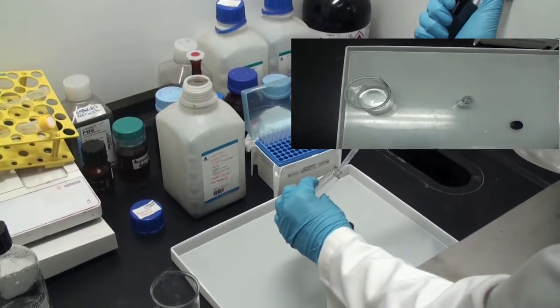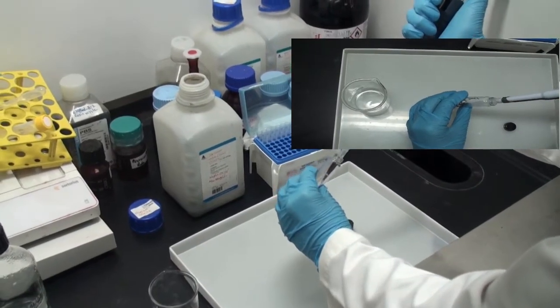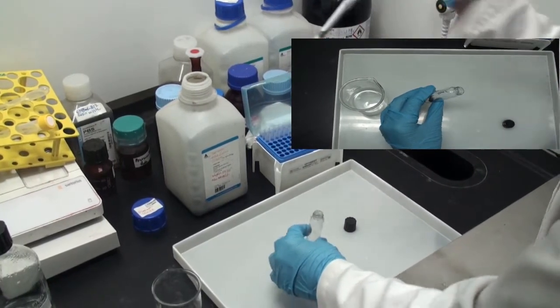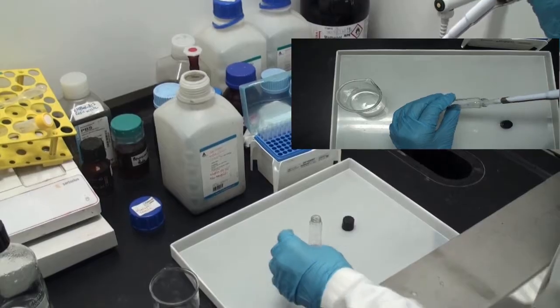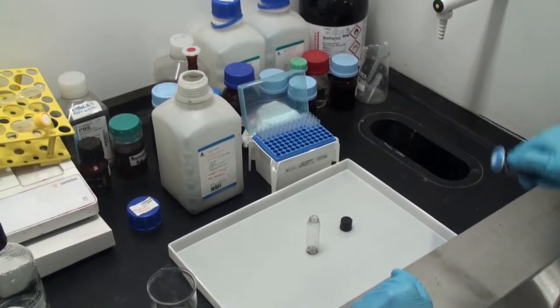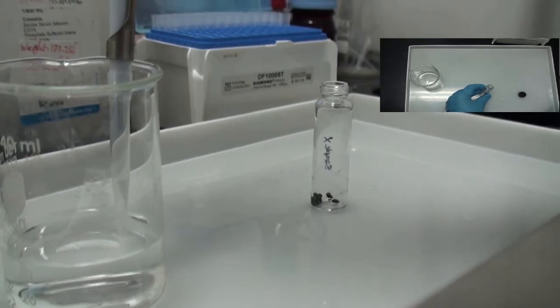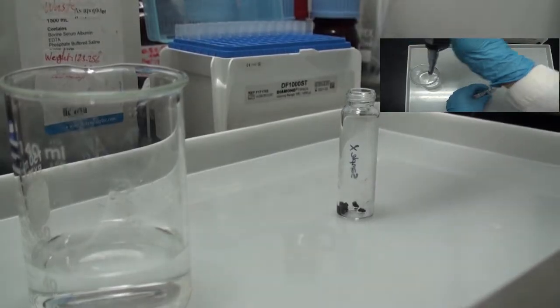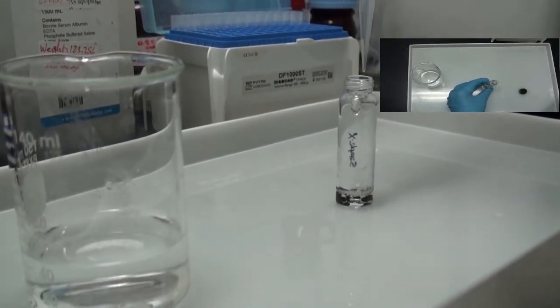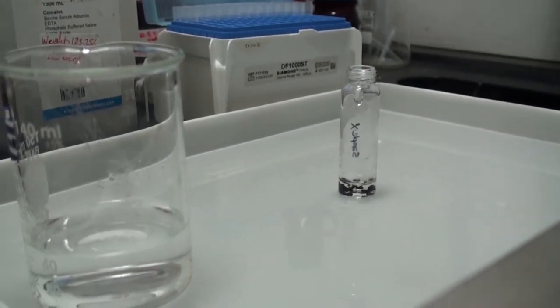Now we will remove the osmium tetroxide from our sample. Remember to discard it in a safe container because it is toxic. The next step is to wash our sample with phosphate buffered saline (PBS), and we usually do more than one step of washing.